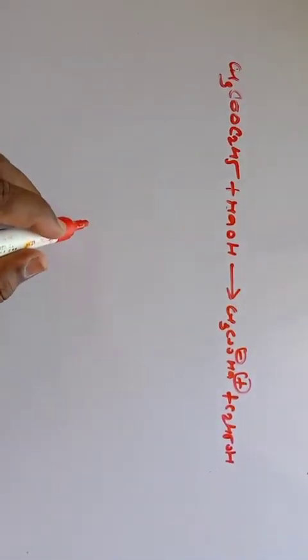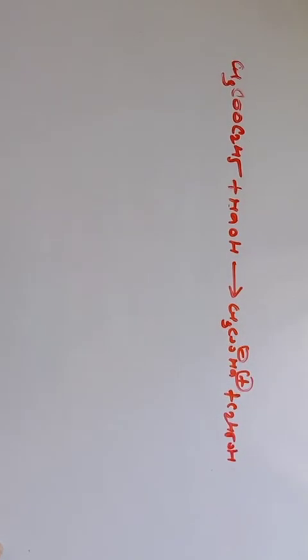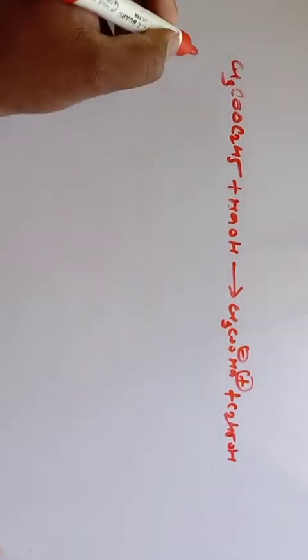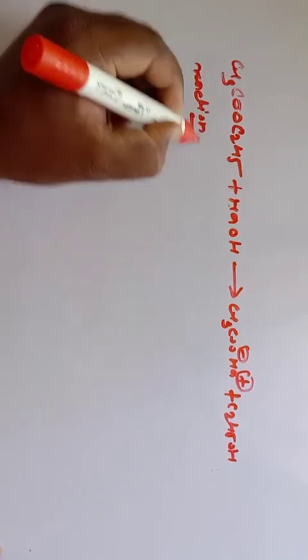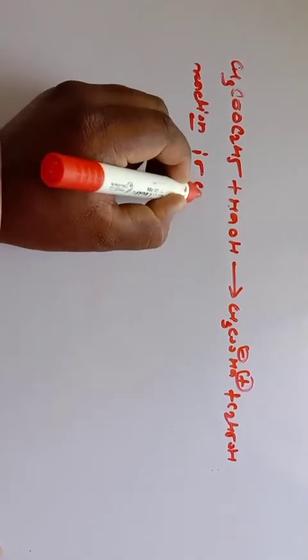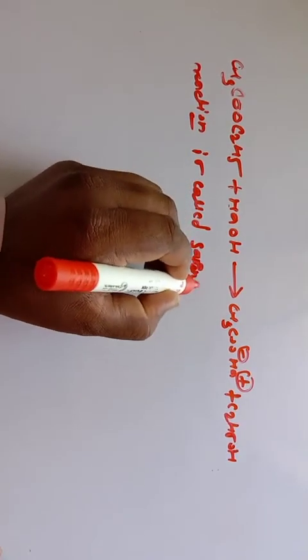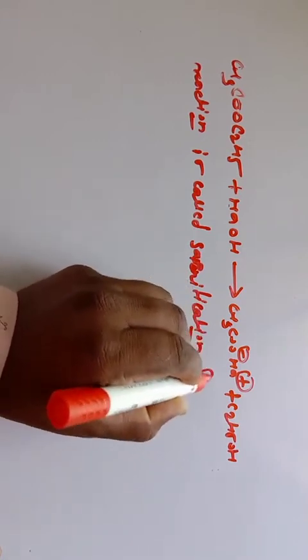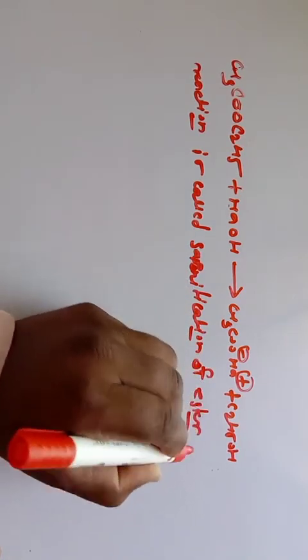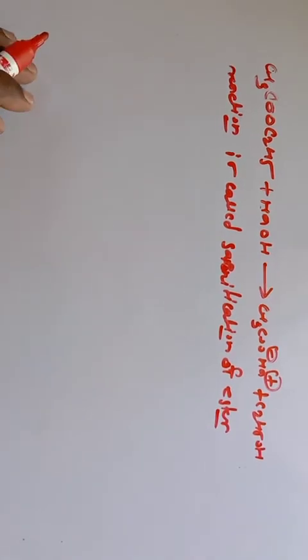This reaction is called saponification of ester.